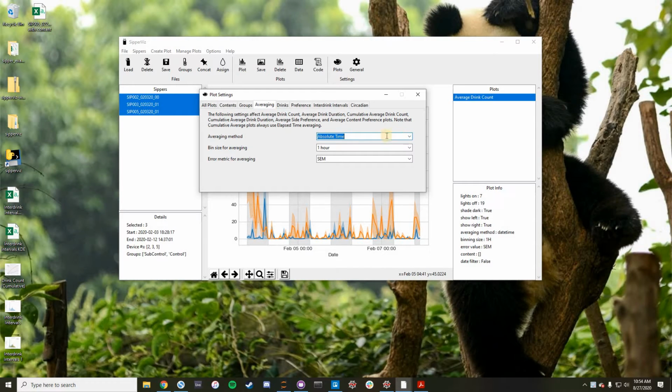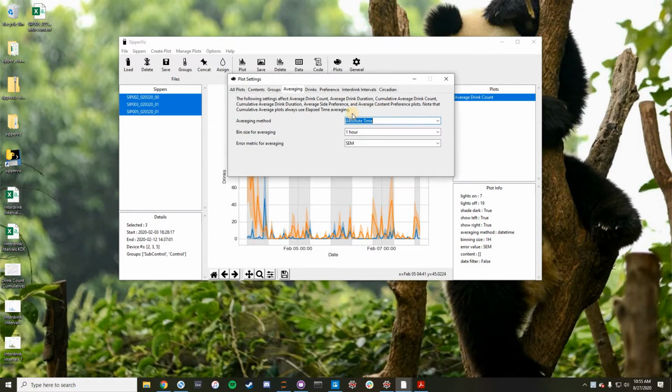Okay, in this video I'm going to talk about these different averaging methods. I'm going to try and explain this as clearly as I can, but I often find that I kind of fumble when trying to describe these. So hopefully this will be clear. Okay, let's get into it.